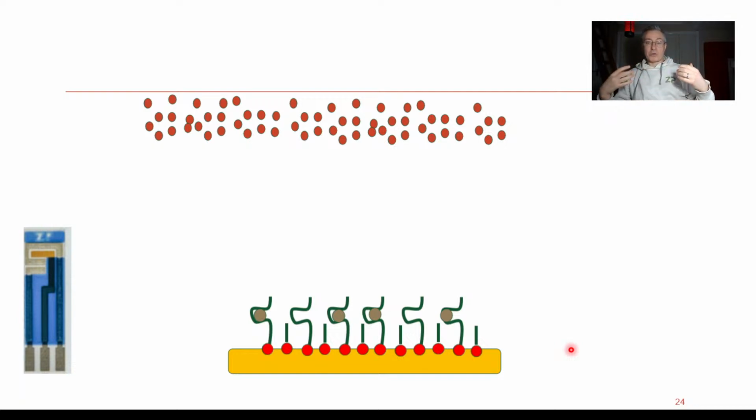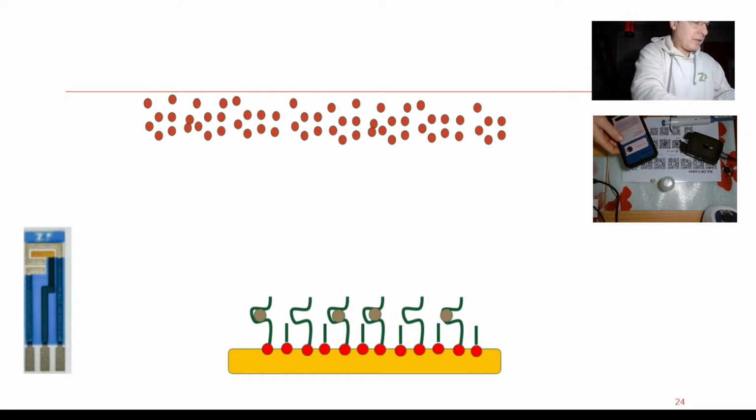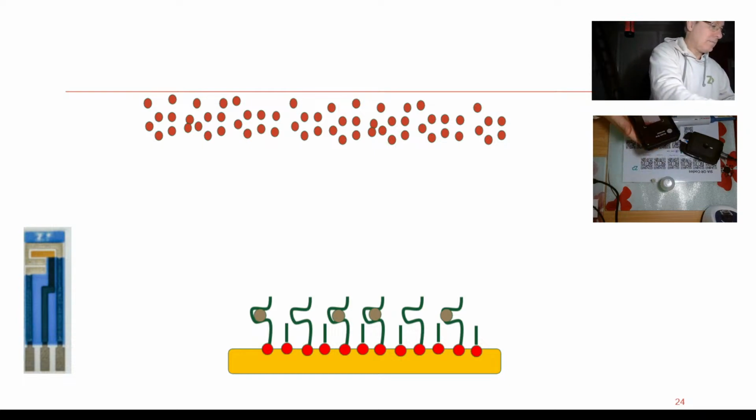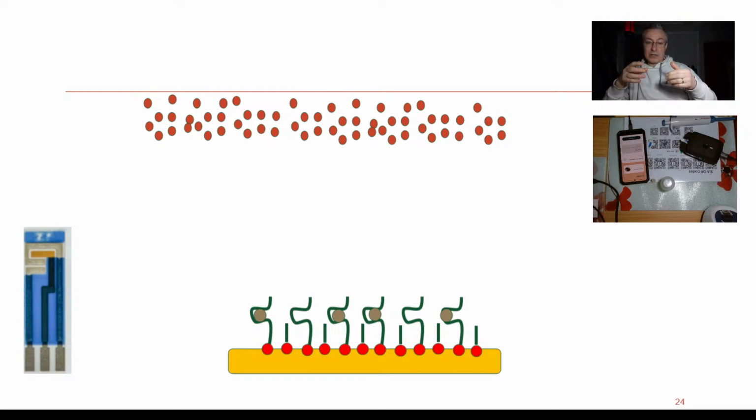That would block the surface, and then they could use essentially a ferricyanide-based signal by using square wave or cyclic voltammetry, as I've been demonstrating on this particular potentiostat. So if I was going to do cyclic voltammetry again, I could just come over here, square wave, cyclic voltammetry. So they could interrogate whether they just got binding, not having to rely on the conformational change of the aptamer, but actually just using a redox reporter.